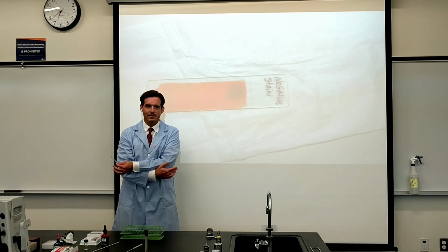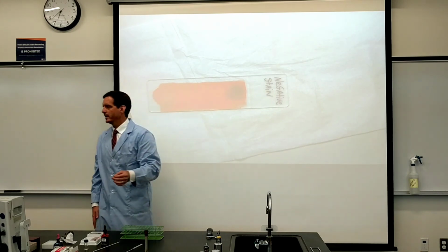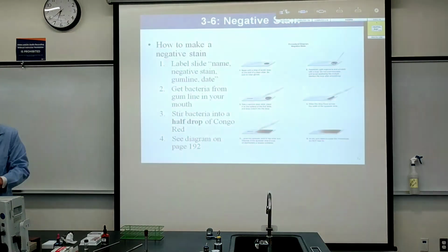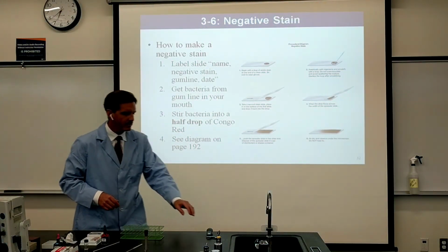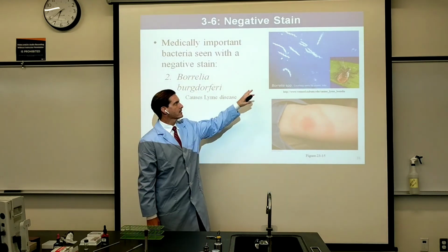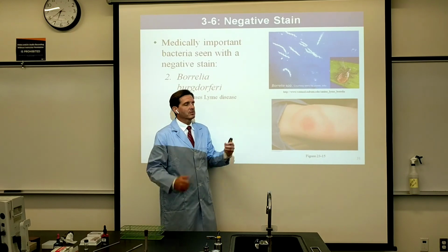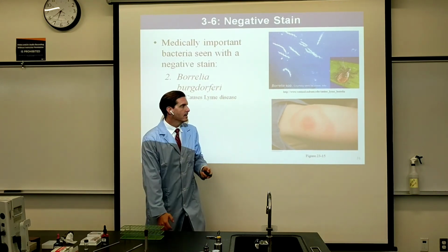That's an interesting fact about simple stains, is that the simple stain kills the bacteria or the cheek cells. In this case, what we're doing is we're letting this air dry, but realize that the cells repel the dye. So these are the steps we just followed, but when we look at these cells, the bacterial cells are not soaking up the negative stain dye, and they're still alive until they gradually dry out there on the slide.